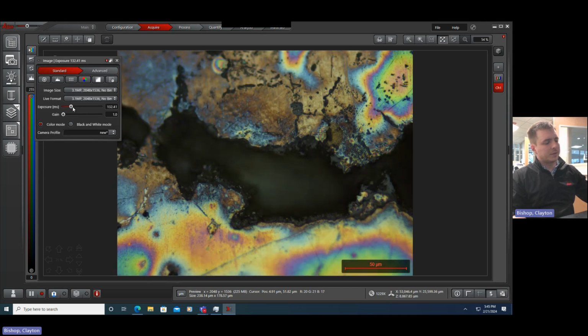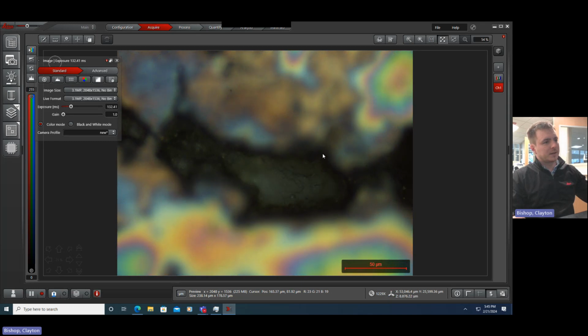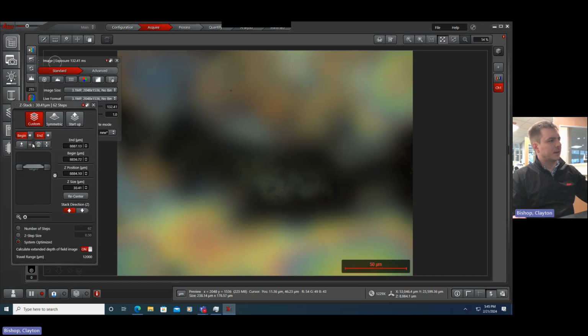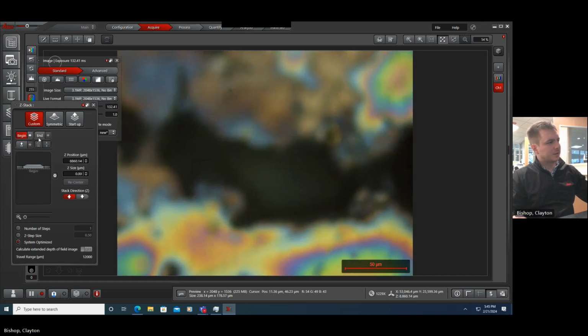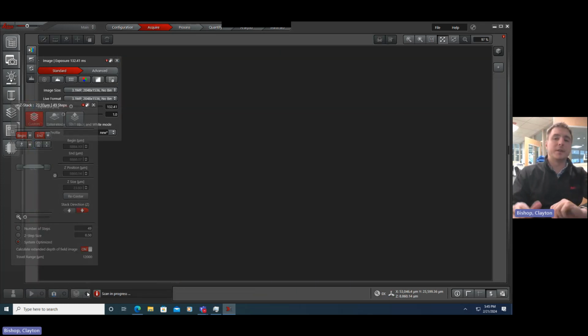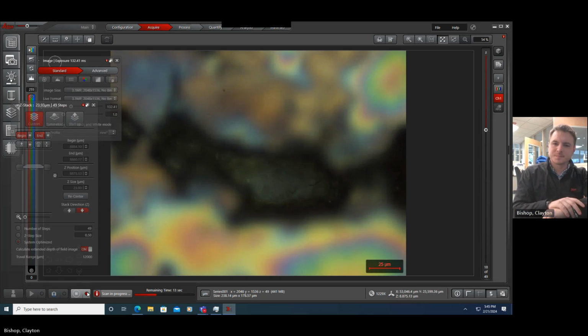We already know we can use a Z-stack, but how can we use the results of the Z-stack to get some promising measurement data? So I'm going to create another Z-stack, trash my old coordinates, begin here, and move through the sample. We're going to take 49 images, 500 nanometers apart, so bear with me. You can follow along on the right-hand side of the screen as we take our Z-stack.